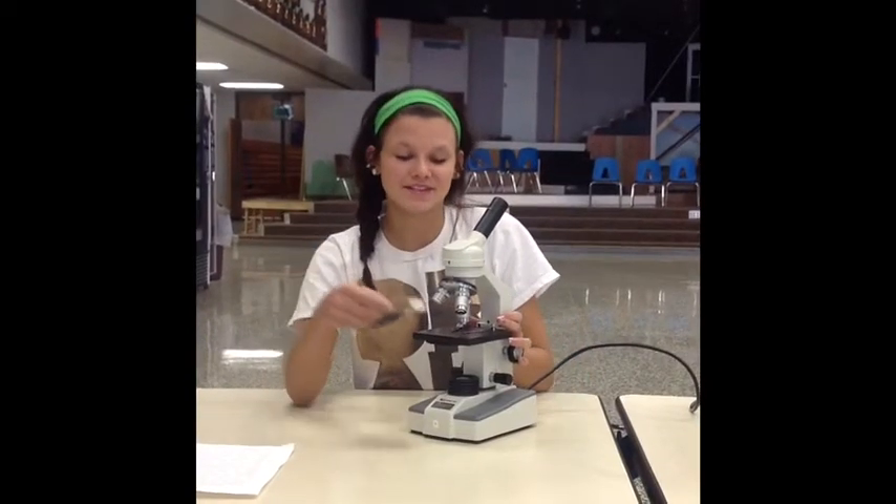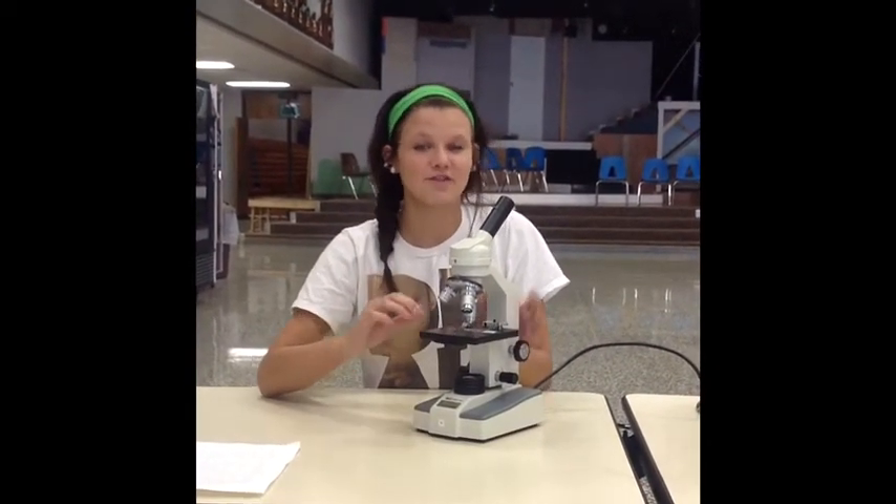Next, place your specimen on the stage, under the stage clips, and make sure it's over the light.